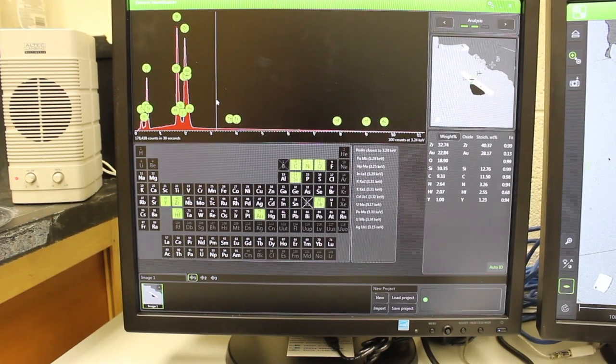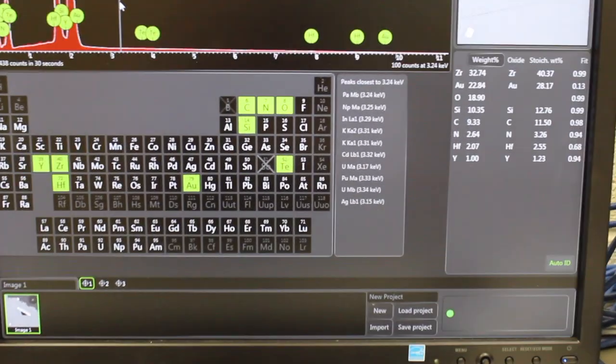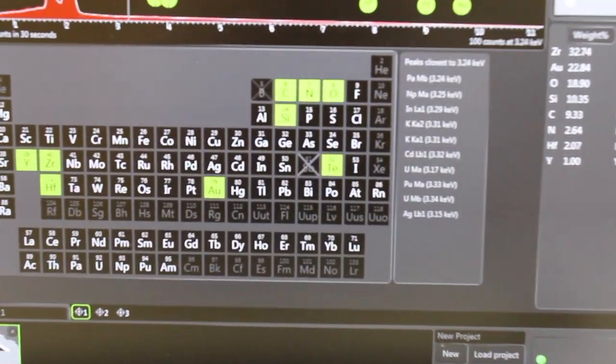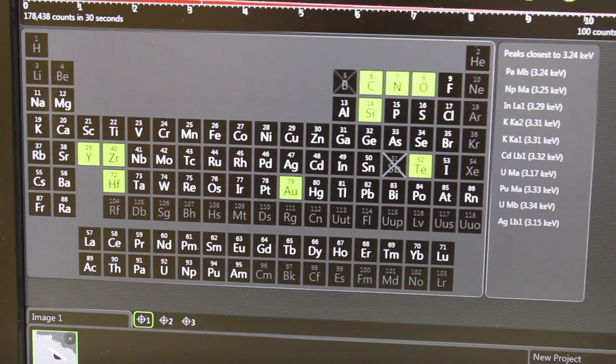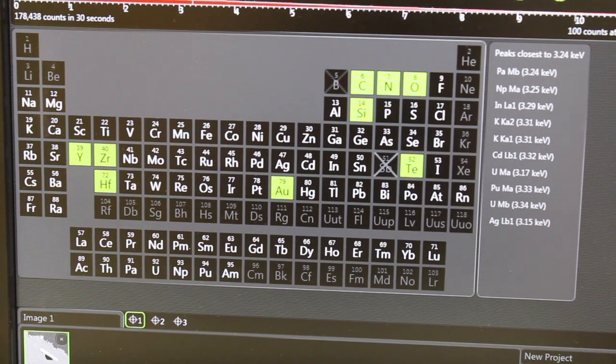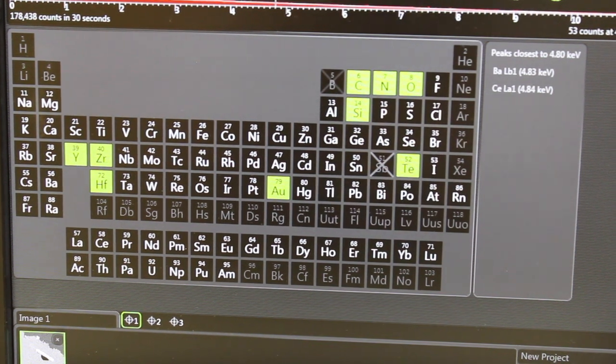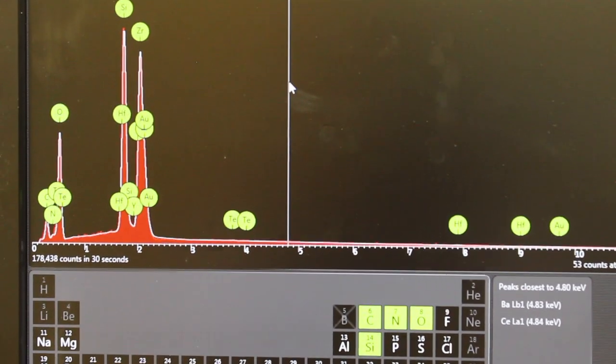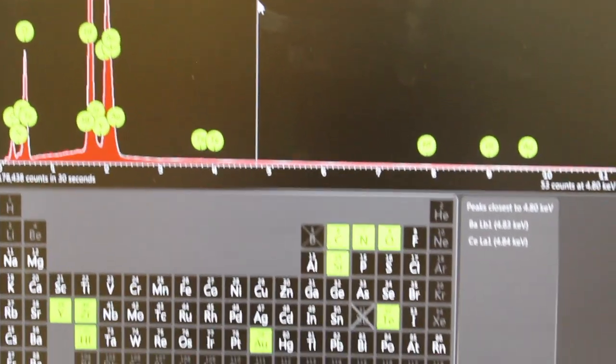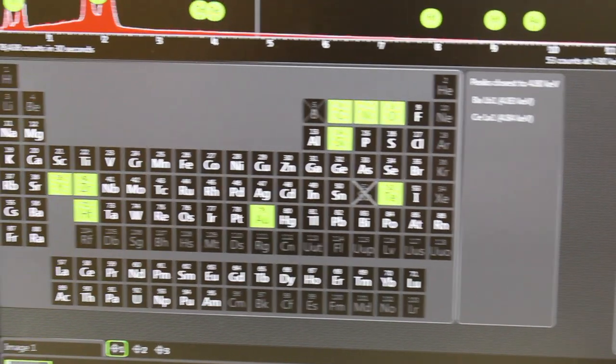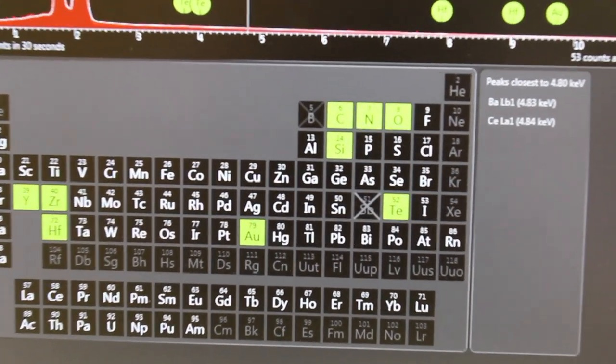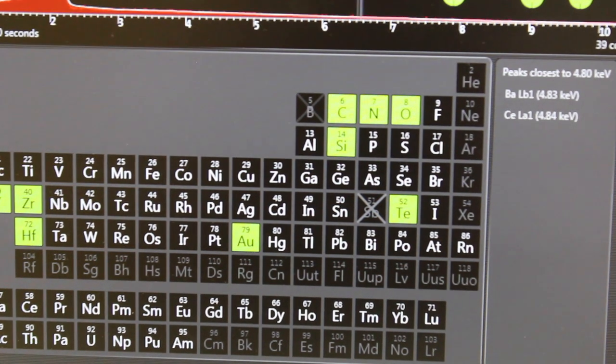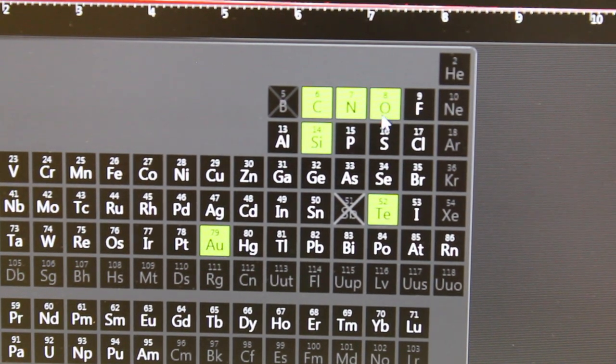You'll see that below that is a periodic table and the software is making an attempt during and after the analyses to identify elements based upon the energies of the EDS bands that you see above as peaks. Some of these need to be looked at by a human and so you're going to have to use your better judgment to decide if the software has done the analysis correctly or not.